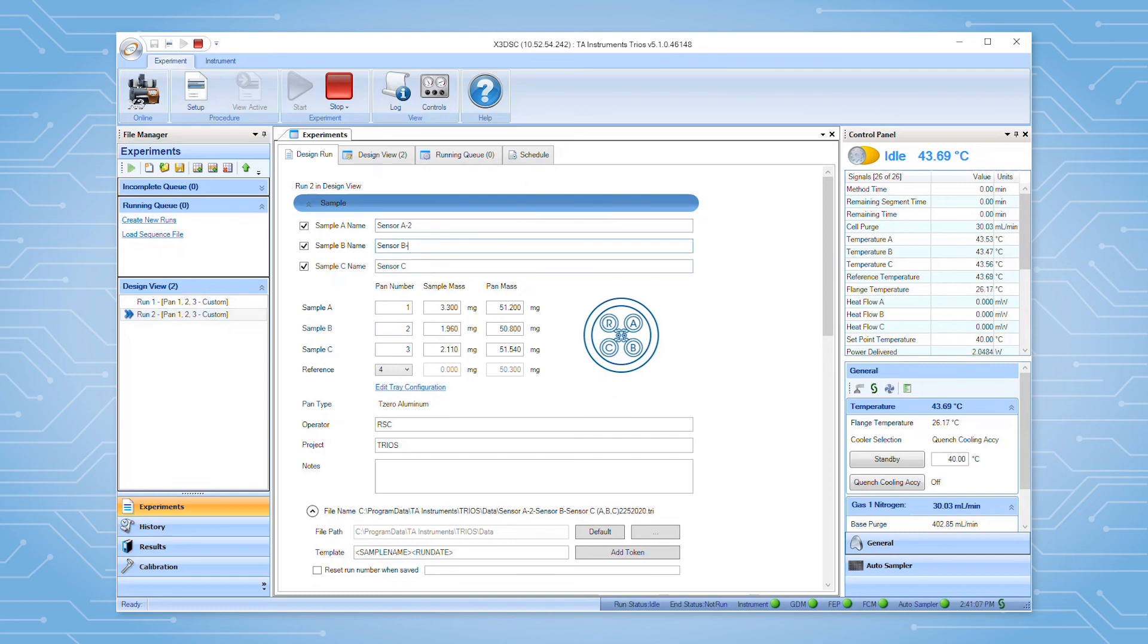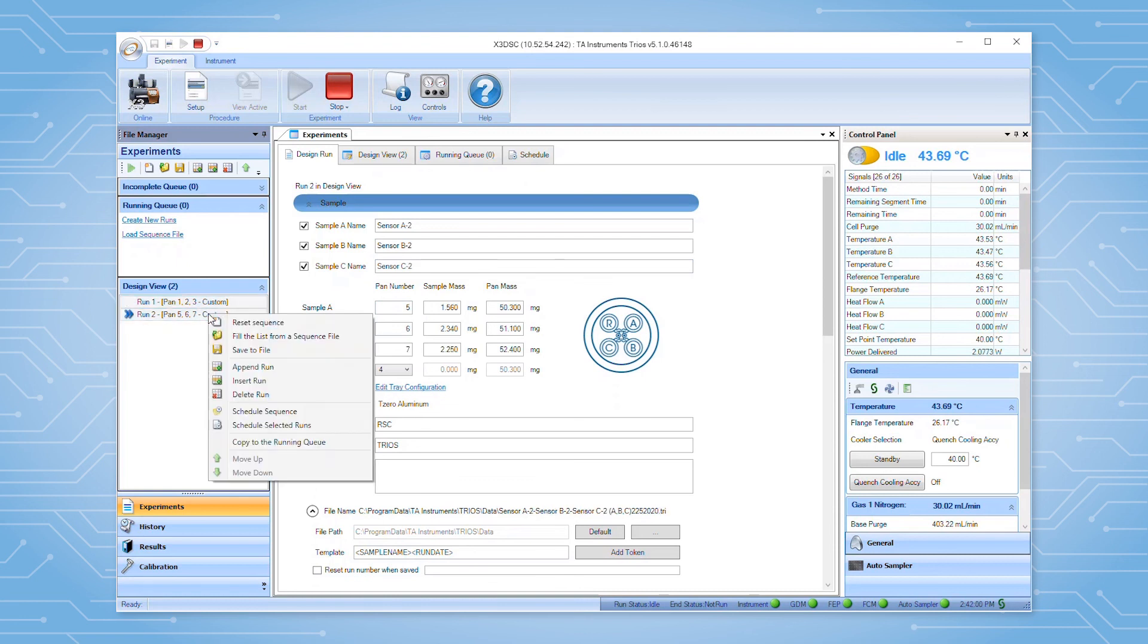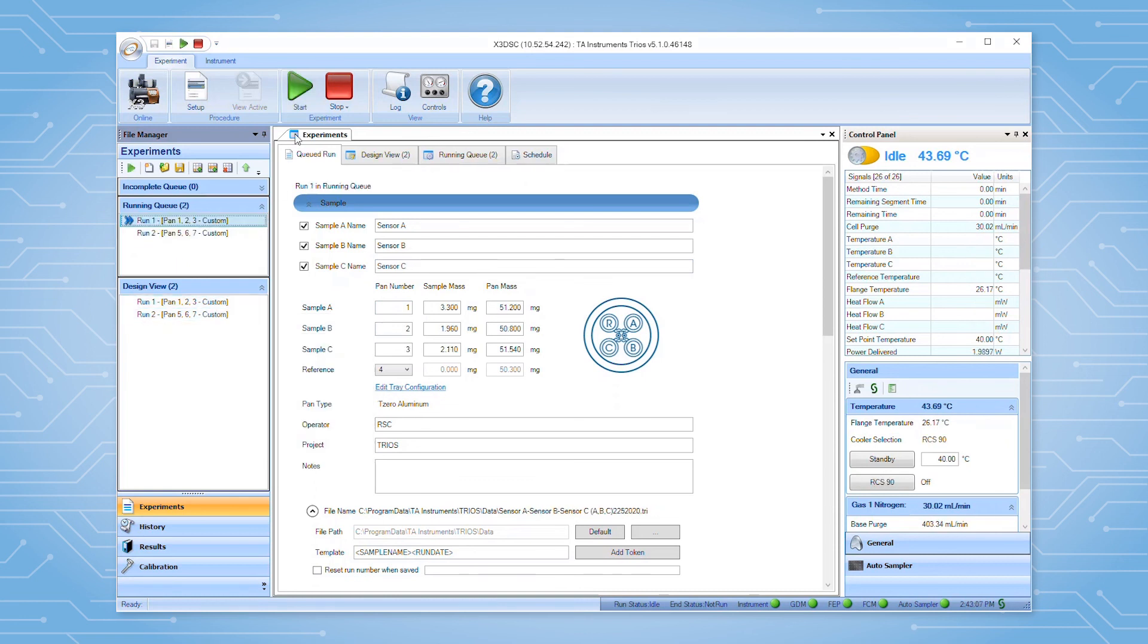To execute the experiments that you have just created, press the start button in the experiment ribbon. If the sequence was created in the design queue, first copy the desired experiments to the running queue, then press start.